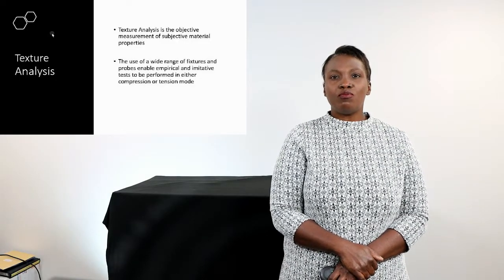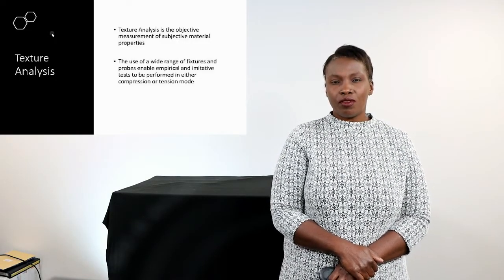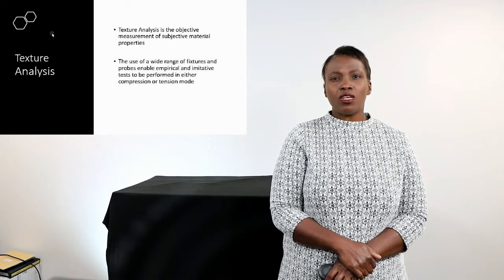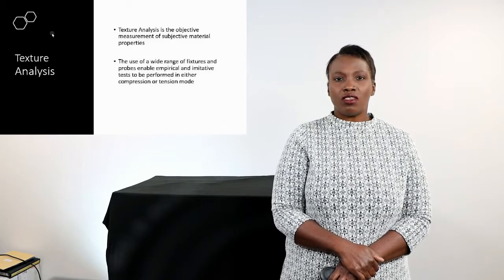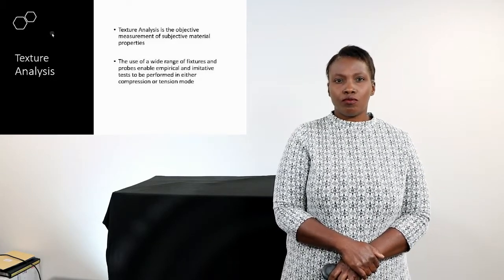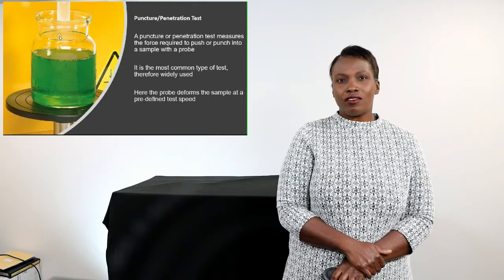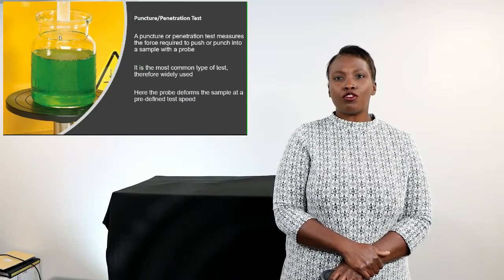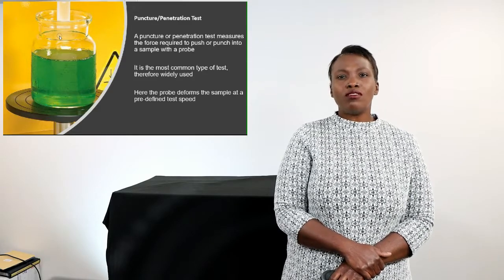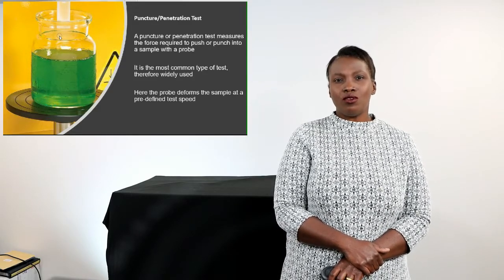Texture analysis is the objective measurement of subjective material properties. The use of a wide range of fixtures and probes enables empirical and imitative tests to be performed in either compression or tension mode. A puncture or penetration test measures the force required to push or punch into a sample with a probe. It is the most common type of test, therefore widely used.